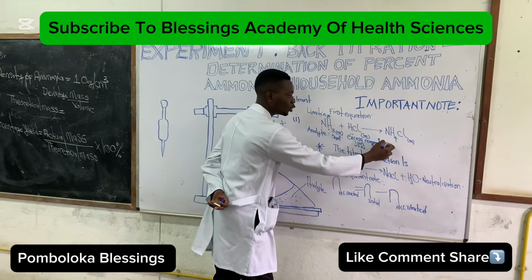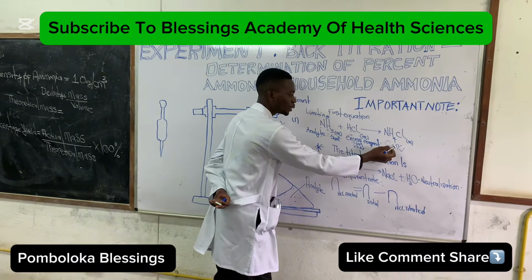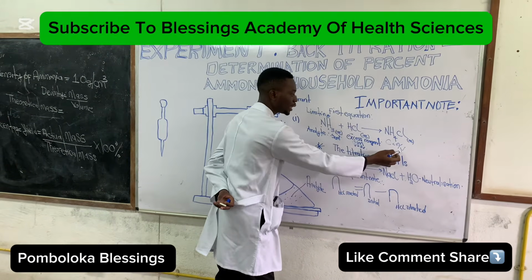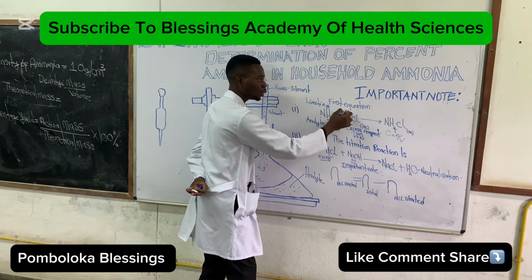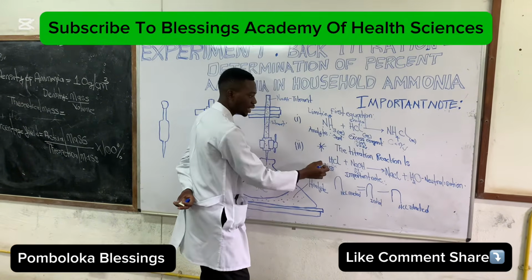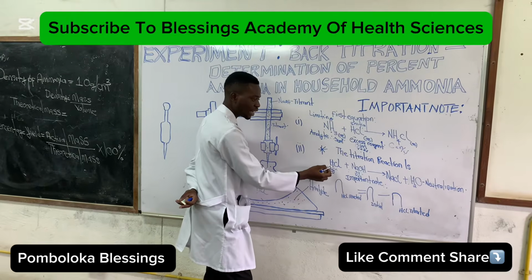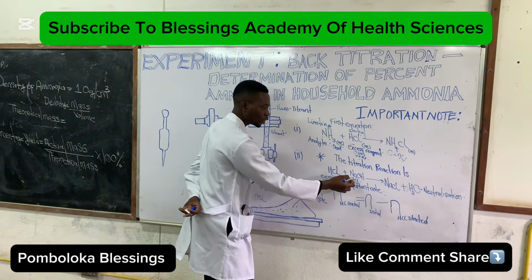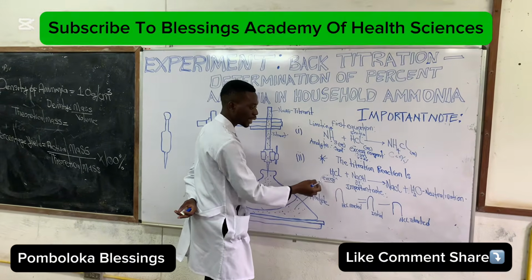We know concentration is equal to number of moles over volume. You can find the initial moles because we have a volume of 25 cubic centimeters and a concentration of 0.1. And then here, you can also find the moles of the HCl because the concentration of the sodium hydroxide has been given, and these are the moles in excess.